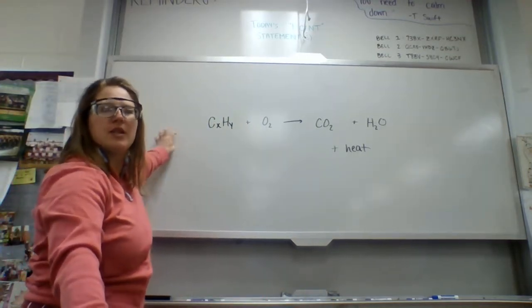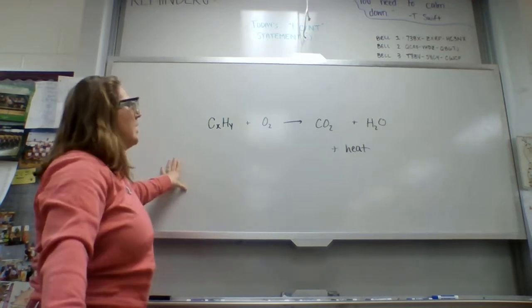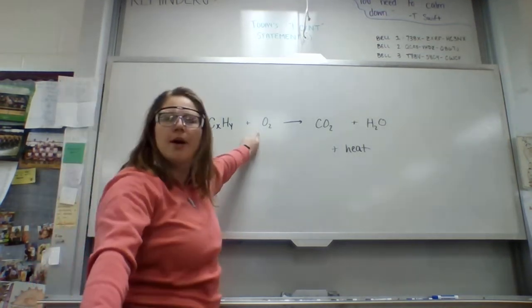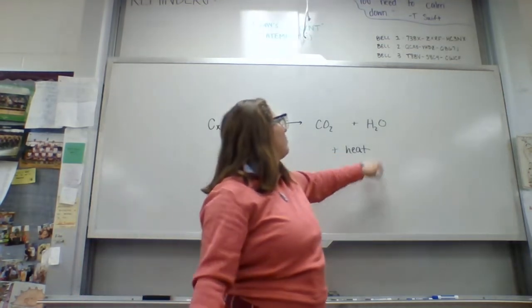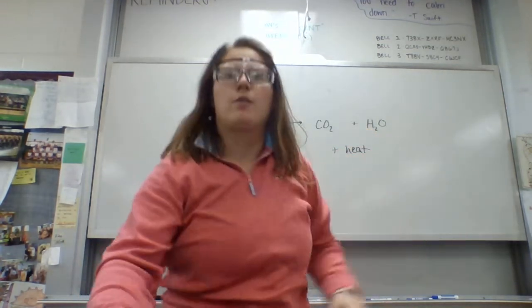Today what we're going to focus on with this reaction is a couple things. One, I want to show you how oxygen is added when we use our Bunsen burners. And number two, I want to show you the proof that water is being formed in our reaction.